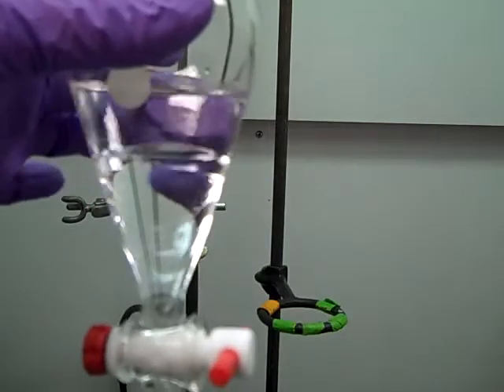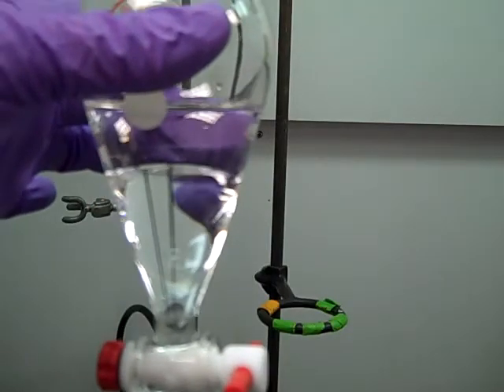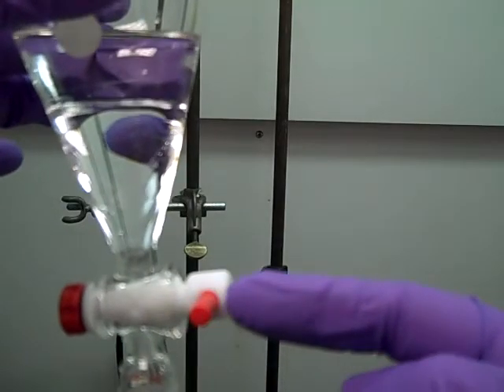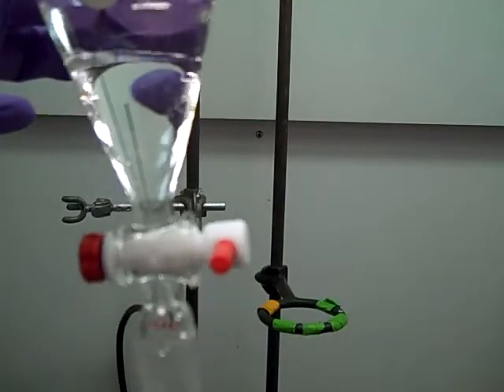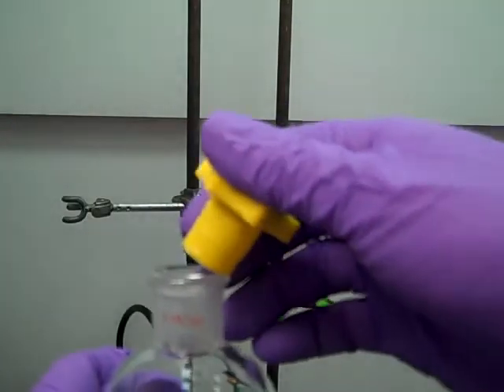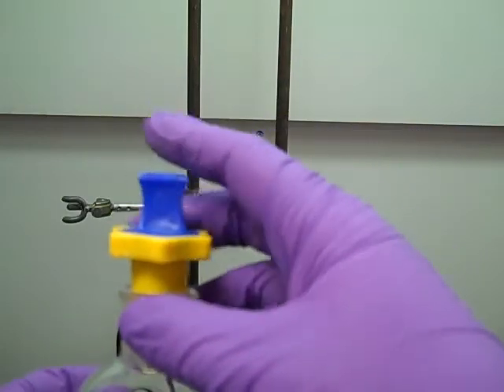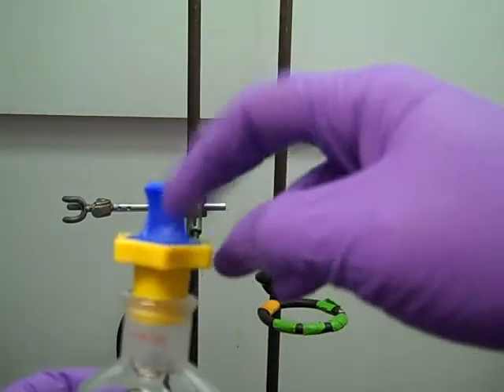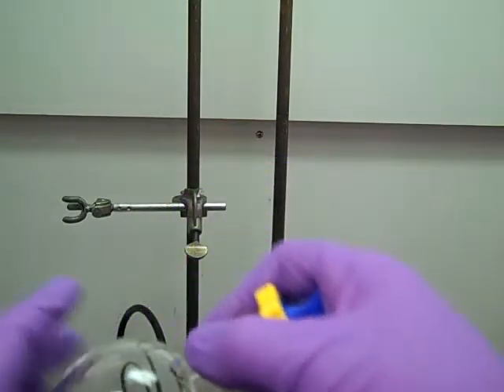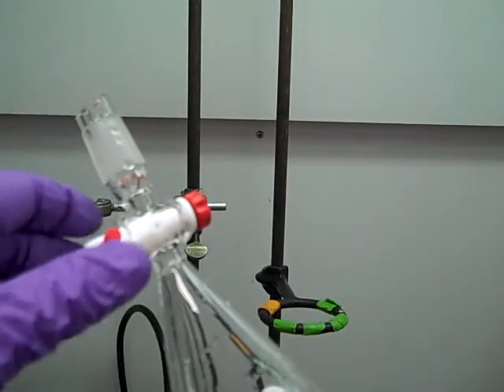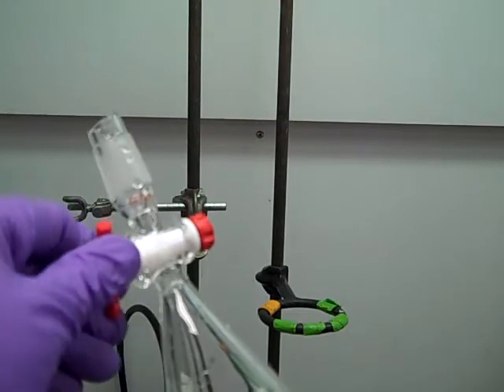All right, so we're going to go ahead and start doing our extraction. We've got our two layers inside the separatory funnel. Before we added it, we made sure that our stopcock was closed so that nothing spilled out the bottom. And then first thing we need to do to start the extraction process is firmly place the cap on top. So at this point, you want to make sure this is firmly sealed and then turn the separatory funnel over and open up the stopcock.